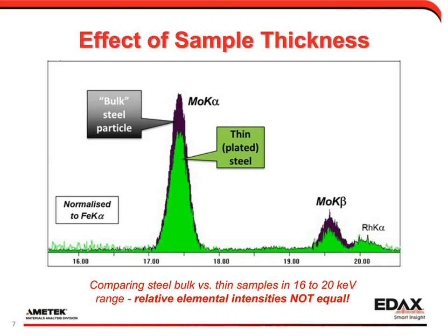And normally, just looking at the spectra, since they are normalized, they might look very similar. But actually, if you look at some of the other elements, like in this case moly, you could definitely see a change in relative intensities. They are not equal, and if you were to quantify this sample, of course, you would get two different answers, even though they are of the same composition.